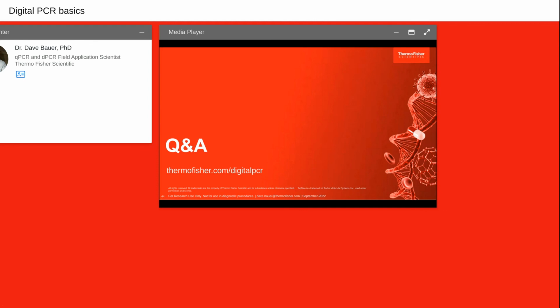Yeah, we briefly alluded to the idea of dead volume, where let's say in a system, we're going to load 10 microliters of our reaction mix into the instrument or into the plate to get assessed. Some instruments might take, say, 10 microliters and then only actually utilize and get data from a fraction of that, maybe half that volume or something like that, because some of that volume maybe wasn't effectively incorporated into a subreaction.